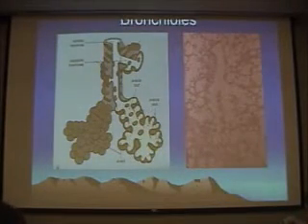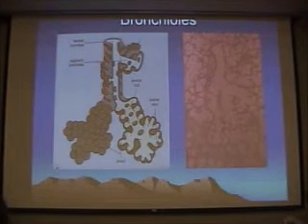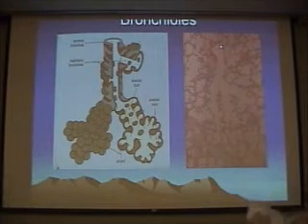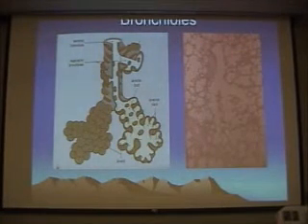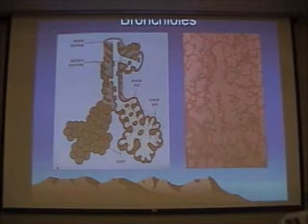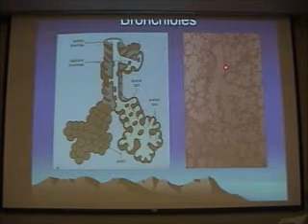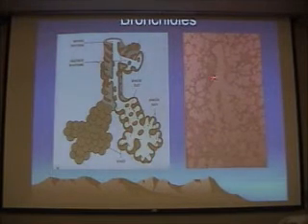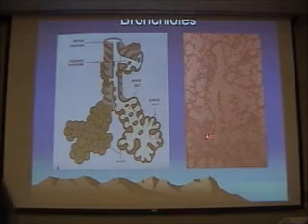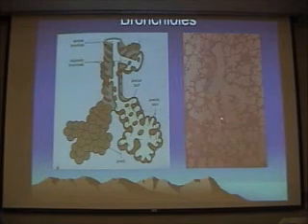When you get to the smallest of the branches of the bronchiolar tree, we have a terminal bronchiole lined by respiratory epithelium, which becomes progressively thinner and more cuboidal with the addition of things like Clara cells and alveoli. So this now becomes a respiratory bronchiole because you can see individual alveoli off to the side in this region. The terminal branches then are known as alveolar ducts, which are lined by these abundant alveoli. So the alveoli off to the side.